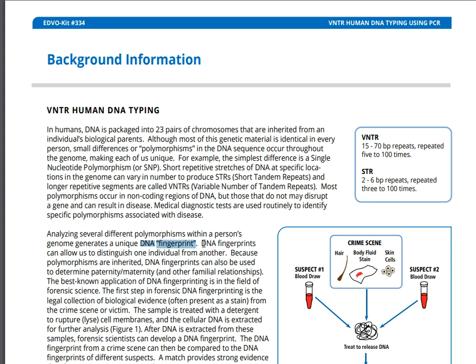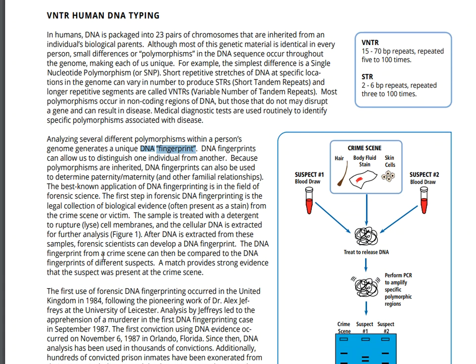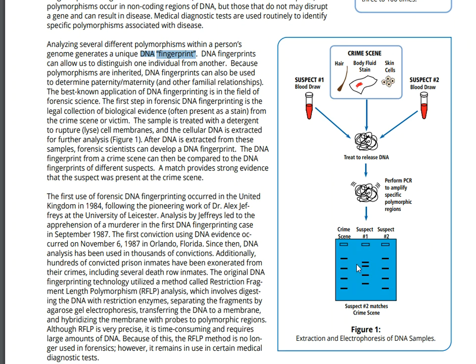Because your DNA is different than mine, and we need to figure out how it is different. If we can show that on the electrophoresis, then we can start identifying and playing match game between the DNA samples that we find. It's these polymorphisms that allow us to see the different banding and the different ways that the DNA sample shows up on the electrophoresis from sample to sample. That is why polymorphisms are so important, because they help us determine what we see on the electrophoresis gels. And that's what you're seeing over here on the right hand side of the screen.